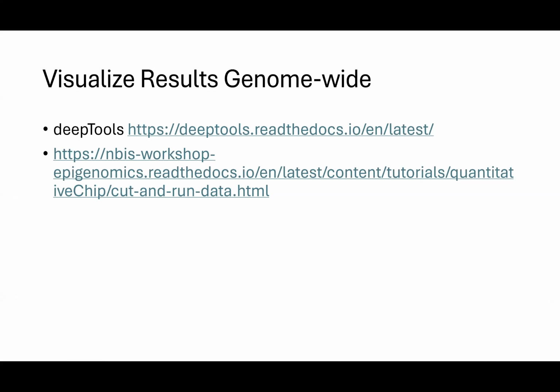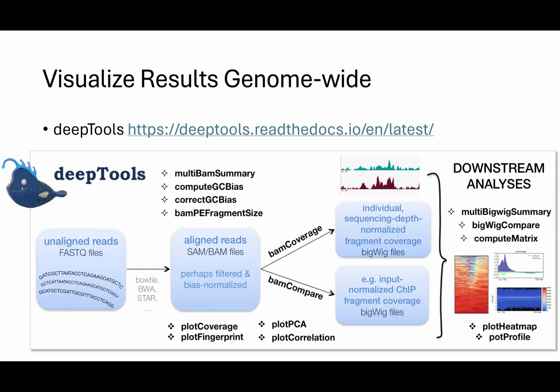So again, I think visualization is the best place to start. I'm going to hurry up a little bit. deepTools is one of my favorites for this, after you've done IGV. It's going to make those genome-wide plots like Kira was alluding to, where you can see what's happening at a larger level. It has a bunch of tools that are very useful, shown here. Some of them we won't talk about, but there's a lot in that package, and they have really good documentation on their website.